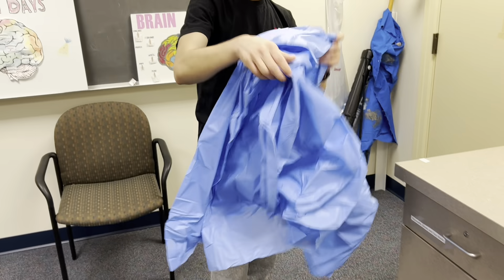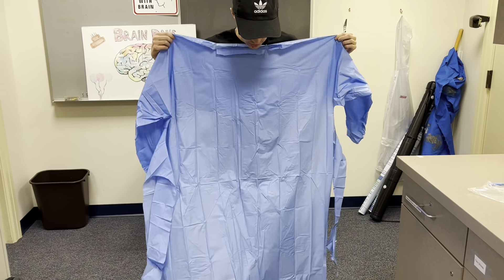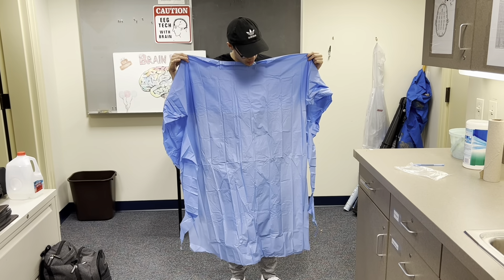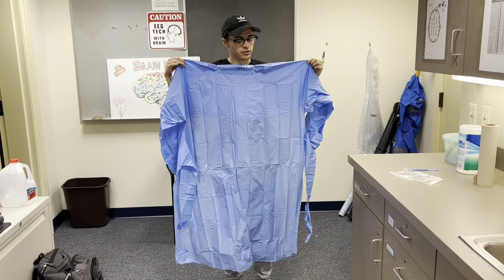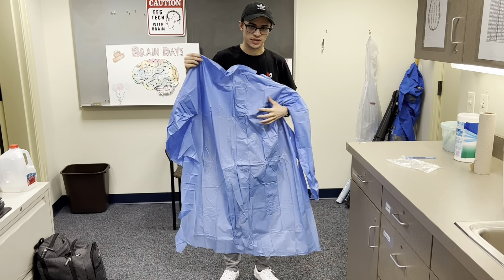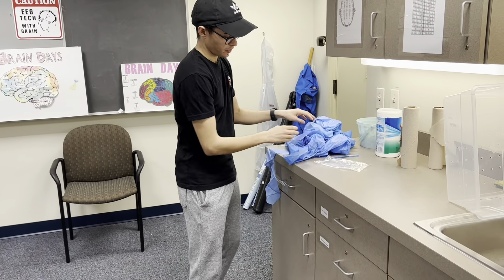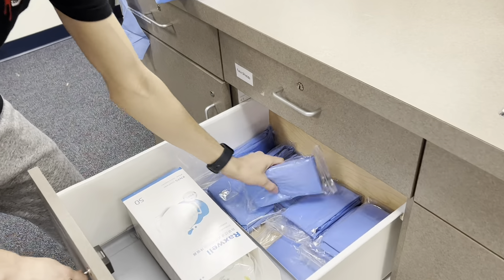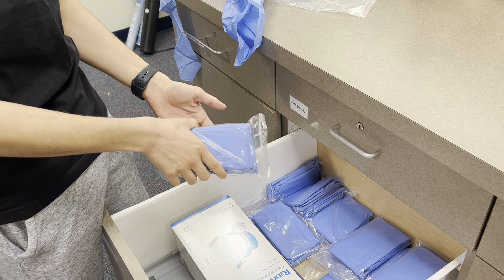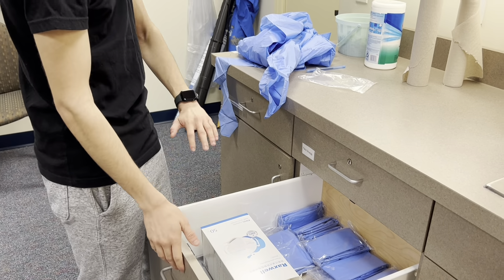The gown can cover your entire upper body and your full arms. So if you weren't able to change your clothing when you come into the lab, this would be a good option if you're really worried about getting stuff on your clothing. It covers your entire arms and pants, or any skirt that you like — it will keep you clean. They look like this, in this little package. As they are disposable, just throw them out when you are done. There's no need to put them back in the container or in the drawer — just throw them out.